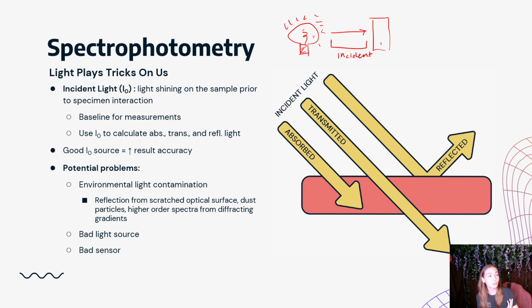Anyway, computer is stupid. The computer doesn't know that I've just multiplied the amount of light that I have within my system by a factor of 30 or 40. All that it knows is more light. More light means more concentration. That's not good. We don't want that.